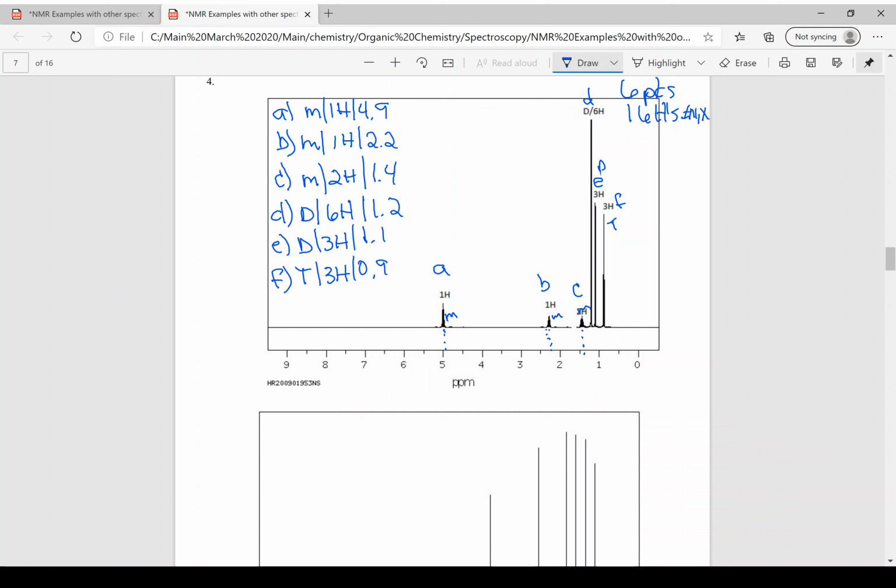Now again, this 1 hydrogen. Okay, so there's my 1 hydrogen, but it has shifted a lot. So I'm going to put a little asterisk note to myself. It's next to somebody that's pulling on it. All right, this multiplet at 2.2, well, I like the number. It says to me it's next to somebody sp2, so next to a benzene, next to an alkene, next to a carbonyl. Now this is the alkene world. Okay, this is the alkene world.